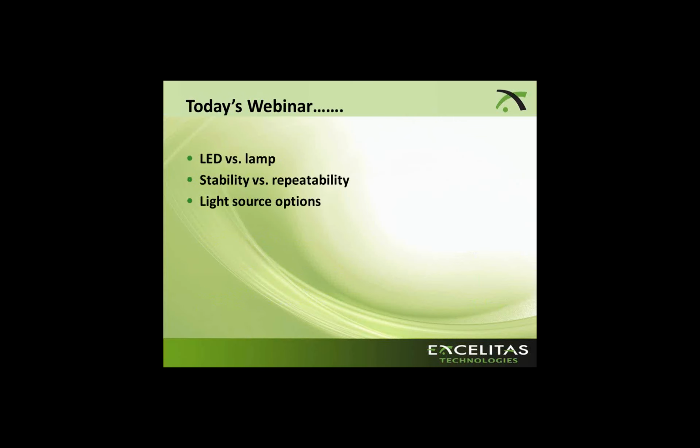So today's webinar, I hope to talk a little bit about LEDs versus lamp, because I know that that is still a very prevalent question out in the market. What should we use? Which one's better as far as spectrum, as far as stability, as far as power? Then I will talk stability versus repeatability, and which is a better measure of stability. And also I would like to talk a little bit about some light source options.